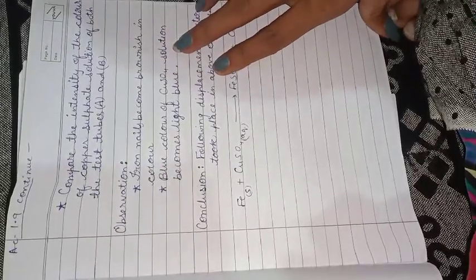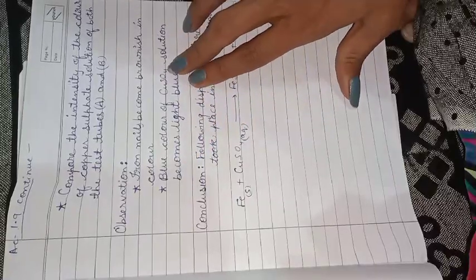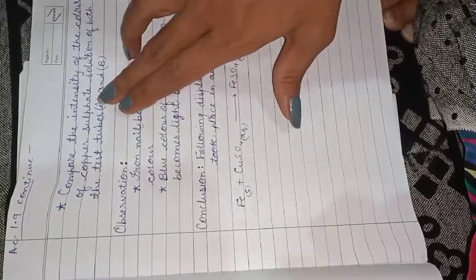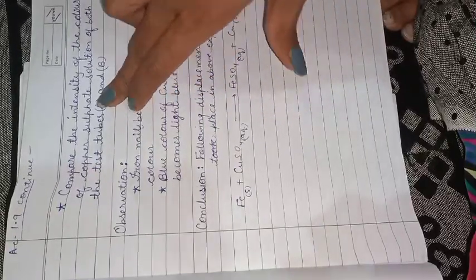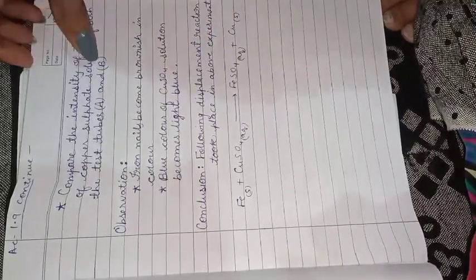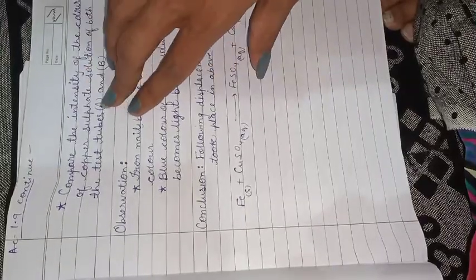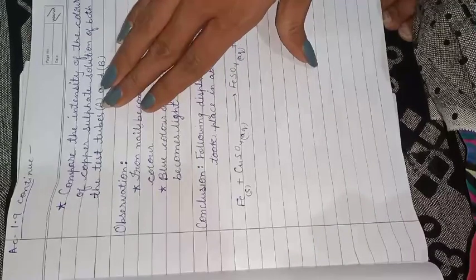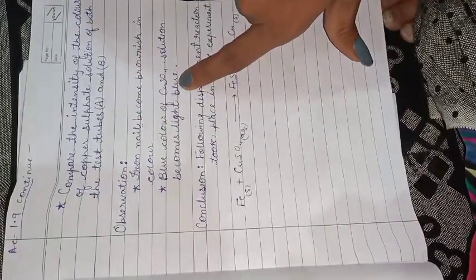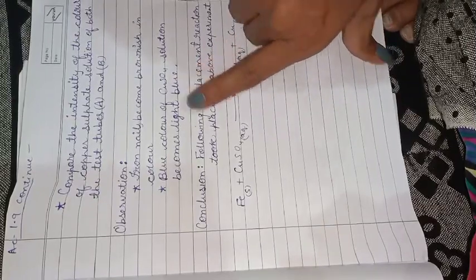And what about the solution? The blue color of copper sulfate solution became light blue. ठीक है ना, ये भी अपने कंपेयर कर लेंगे. जो टेस्ट ट्यूब बी है उसमें हमने कुछ भी नहीं किया था. टेस्ट ट्यूब ए में हमने जो 2 आयरन नेल्स हैंग की थी, इमर्स की थी, उसको अपने कंपेयर करेंगे टेस्ट ट्यूब बी से. सो बी वाली टेस्ट ट्यूब में तो एज इट इज डार्क ब्लू कलर है और ए वाली टेस्ट ट्यूब जिसमें अपने ने इमर्स किया था आयरन नेल्स को, दैट कलर ऑफ सॉल्यूशन बिकम लाइट ब्लू. डार्क ब्लू कलर था ए वाली टेस्ट ट्यूब में, वो कैसा हो गया? लाइट ब्लू.